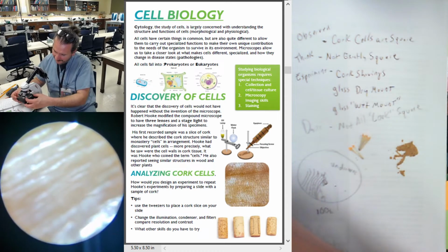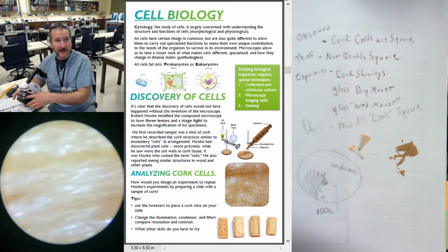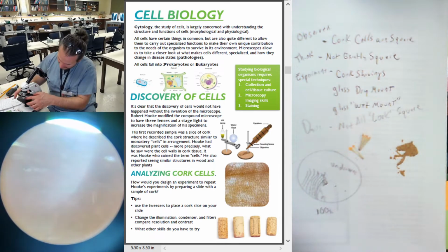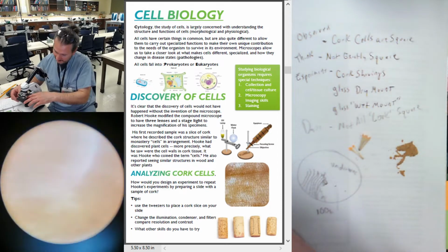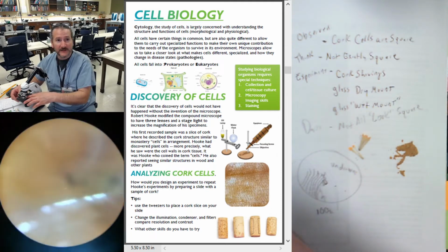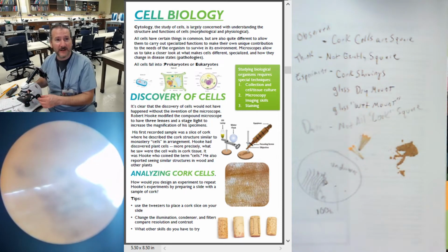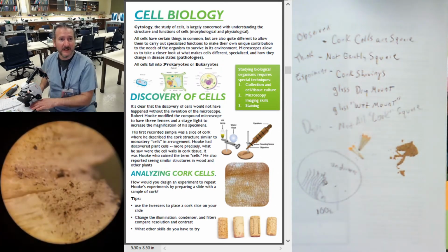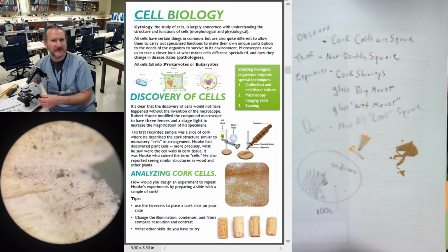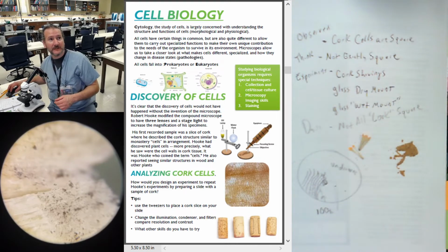I'm gonna lift the stage clip up. In fact, I'm gonna take my stage clips and turn them out to the sides, because I think my slide will be okay. Oh, there's the tip. Cool. You can see some graphite on there. That's decent. Turned off my overhead light. Now I'm just using the room light. I like that. This was just at the scope.